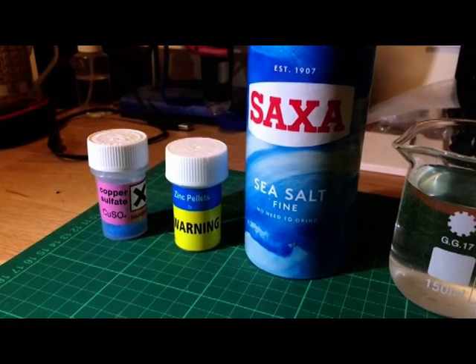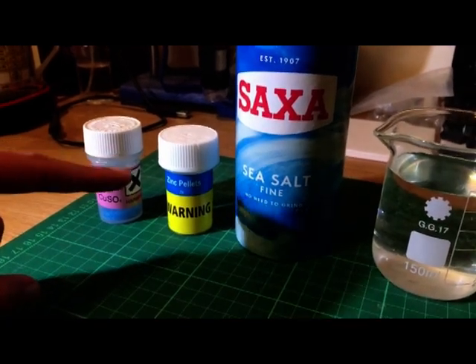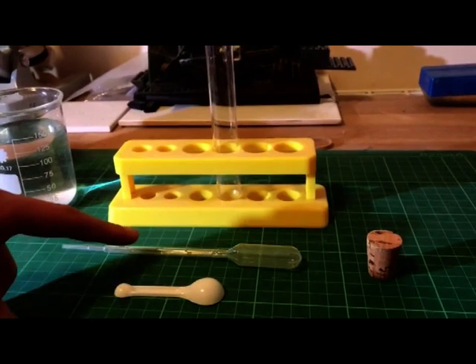For this experiment we will need some copper sulfate crystals, zinc pellets, table salt, water, a test tube, a pipette, and a spoon.